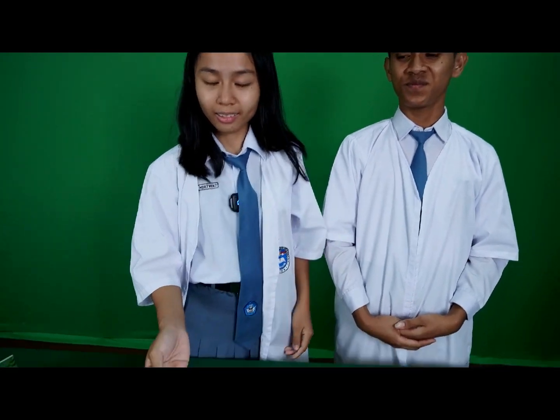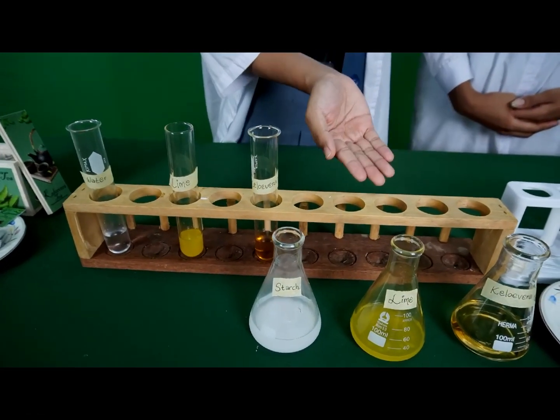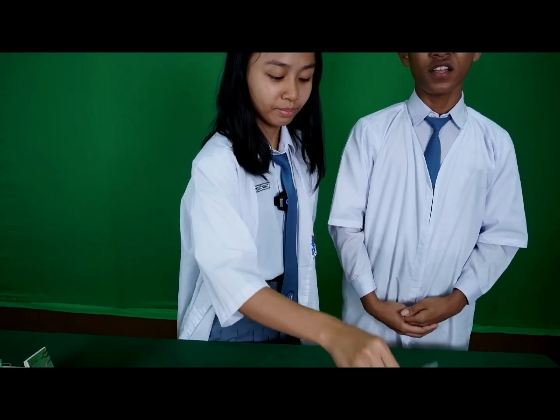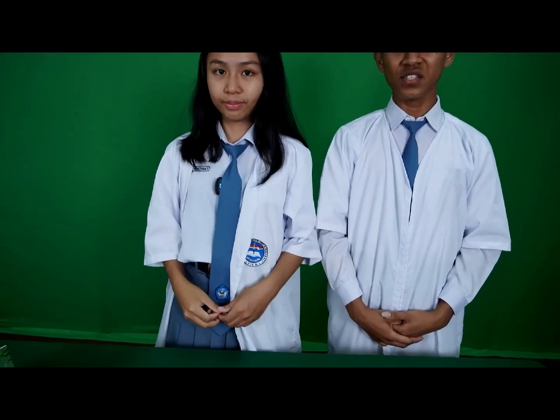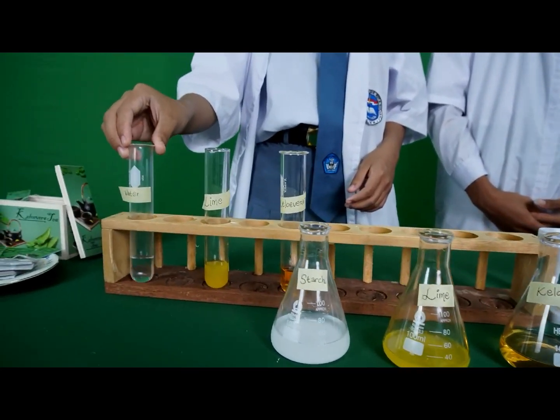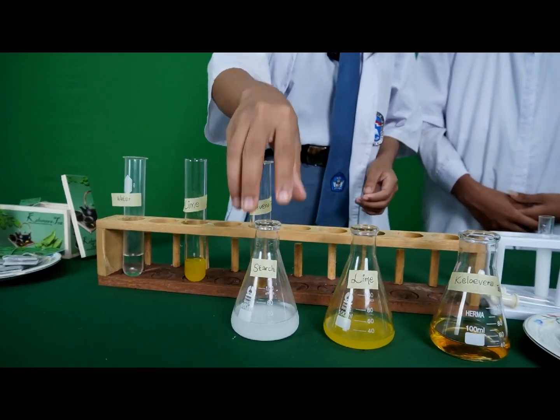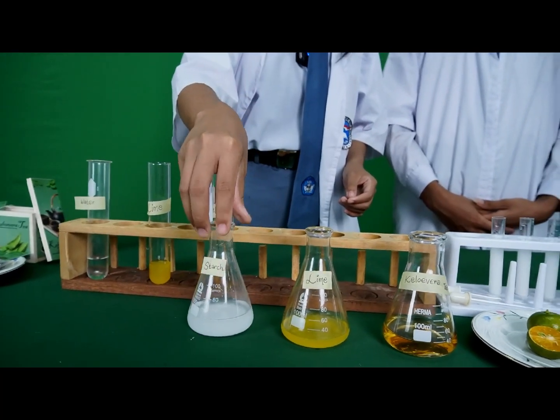Experiment 2, a quality test to determine the presence of vitamin C in Keloevera tea. Tools we need: test tube rack and drop pipette. The materials we need are water, lime, starch, and Keloevera tea.